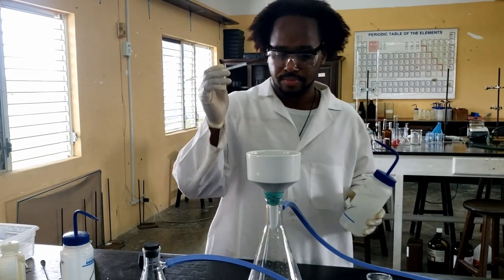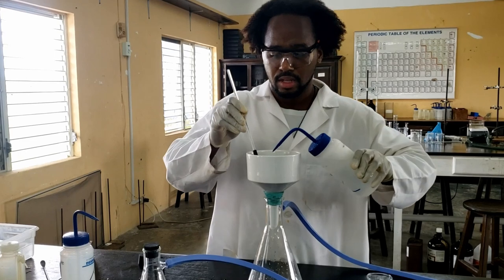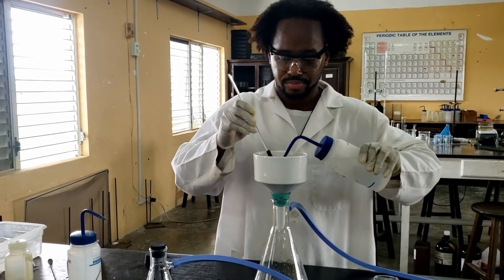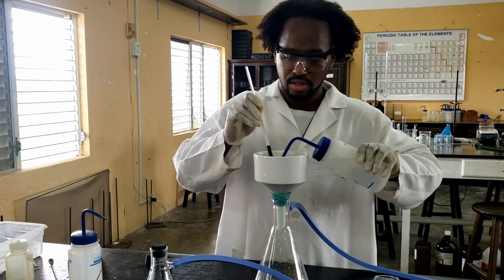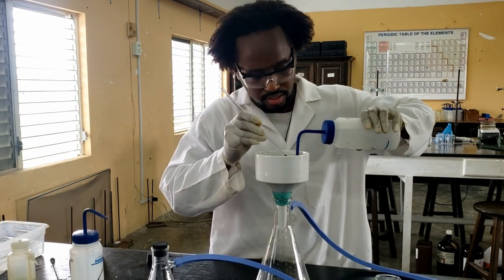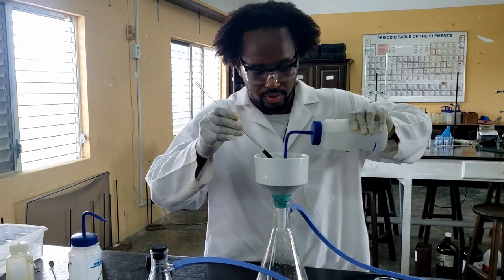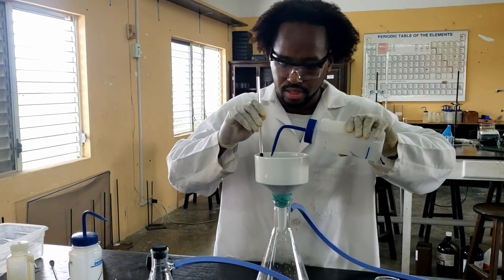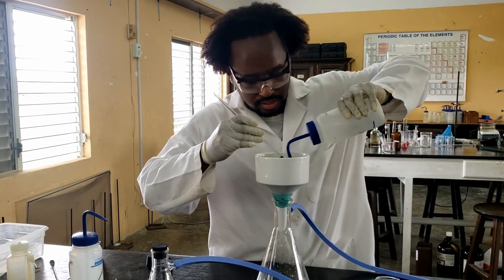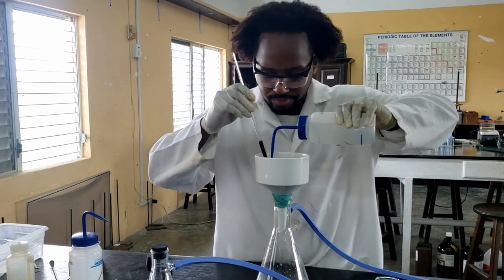Just use the rubber policeman on a stirring rod. Just move around and sort of separate those solid crystals. And again, we want to ensure that the filter paper is not torn or leaking in any areas so that the crystals pass through.